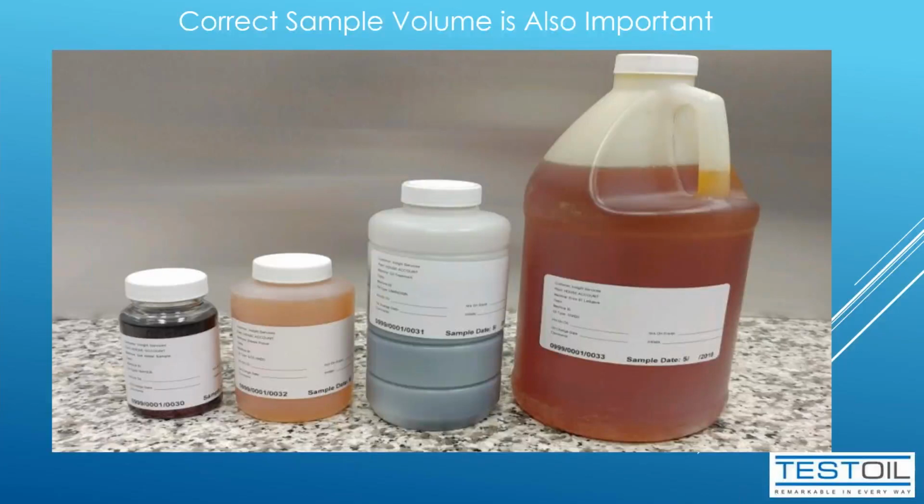We often also receive oil samples that we cannot test due to the wrong amount of sample being sent in. I will touch base a little later in the presentation on the sample volume. But here, these four shown here are our most common bottles that we use for our oil testing.